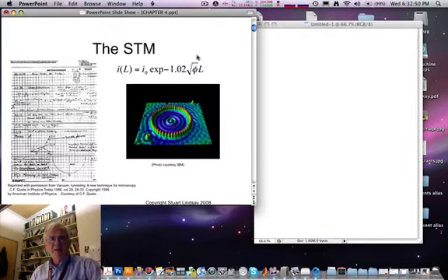On the historical side, I begin with a discussion of the scanning tunneling microscope. In the broader perspective of nanoscience, the scanning tunneling microscope is a fairly obscure tool, but it was really what brought nanoscience into the public consciousness.